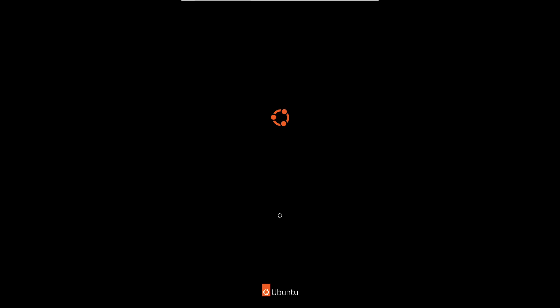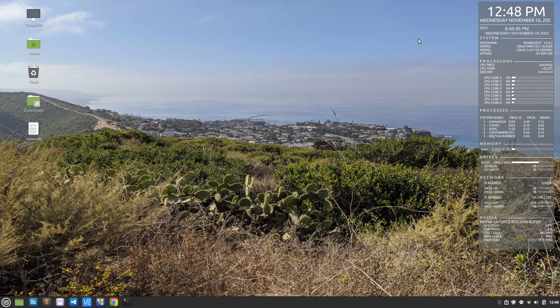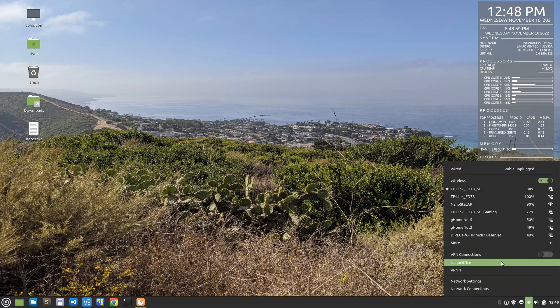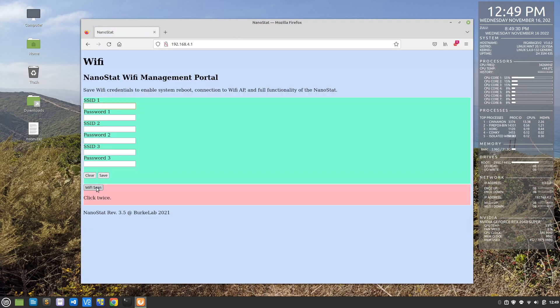Now we're done — everything is complete. We can shut down the virtual machine. Next I'll show you how to configure the Nanostat Wi-Fi. Disconnect it from the computer — all you need to do is power it on. You can use any USB power supply or connect it back to the computer to power it, but we're not using the USB cable for data anymore — everything will be through Wi-Fi. When you first install the firmware, it creates a Wi-Fi hotspot called NanostatAP. Connect to that, then go to IP address 192.168.4.1, which takes you directly to the Nanostat web page.